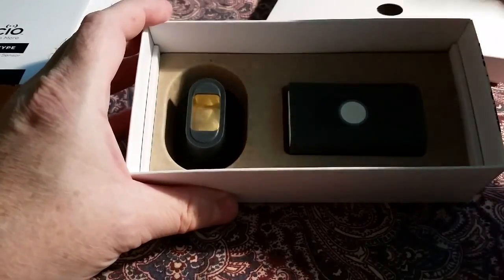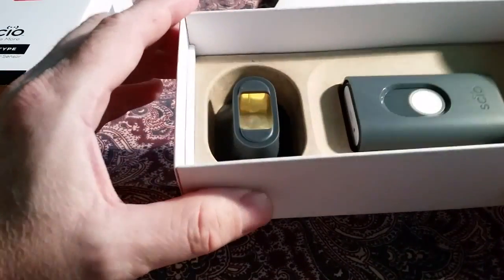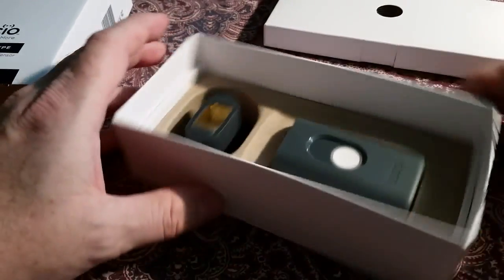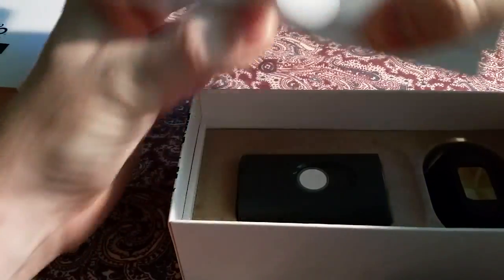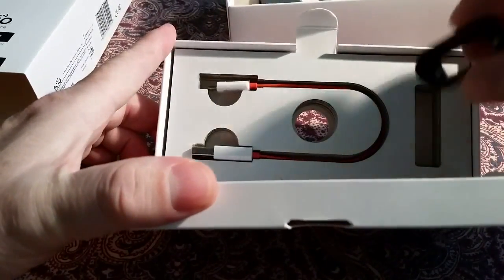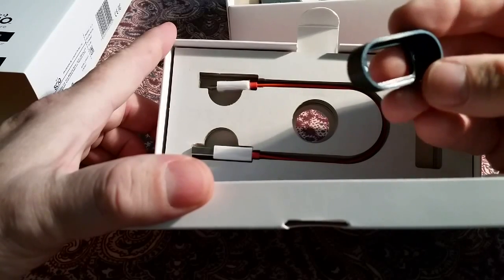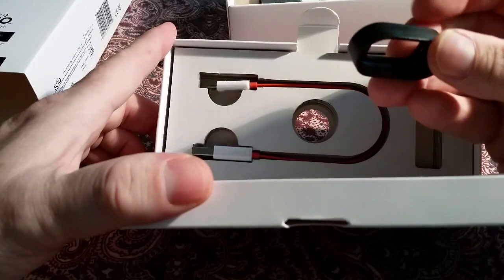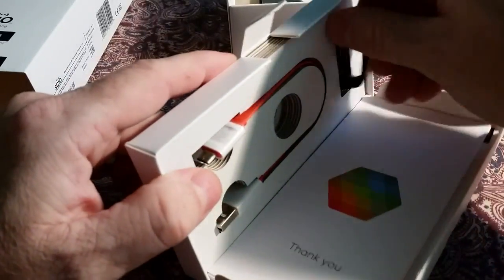There's a SIO and a cup used to examine solids that are smaller than the scan area. Let's look inside. We have a charge cord and a shade slash spacer — this is used outdoors in bright light to shade the scan area a little bit and provides spacing. Looks like there's a booklet in here too.